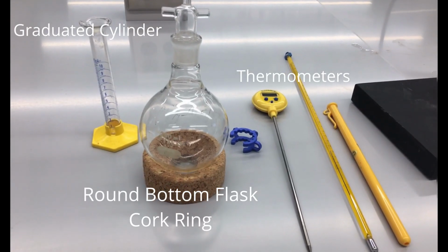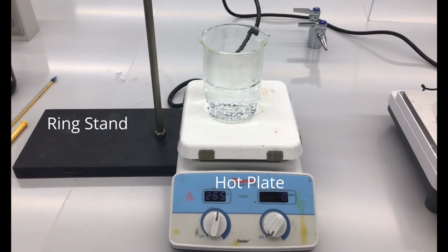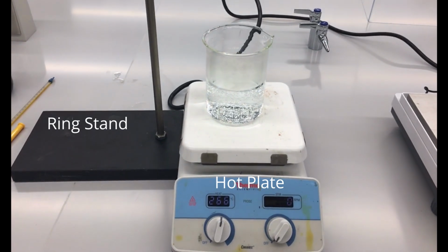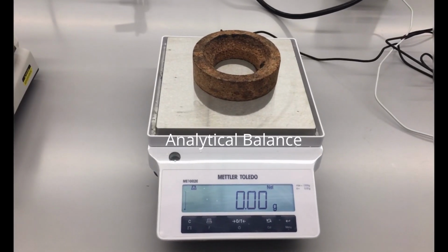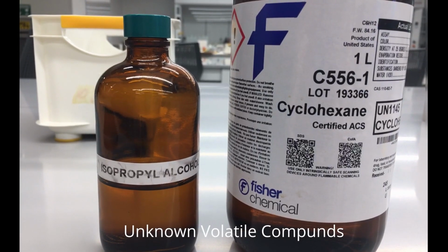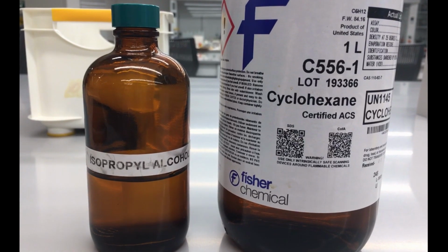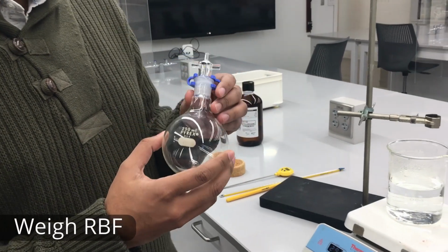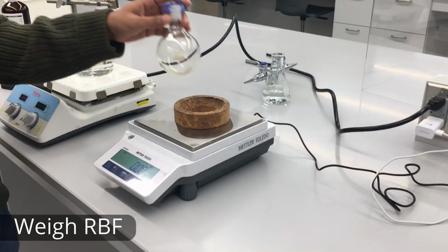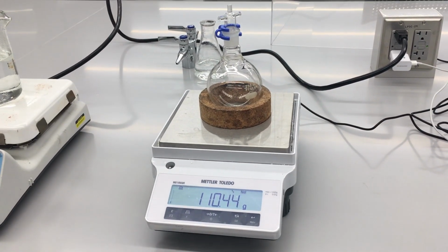Now in this lab we'll be using these materials here to figure out the number of moles and then the molar mass of an unknown volatile compound. We will first start off by measuring the masses of these things, and by subtracting that from the masses of the containers plus the compound, we can figure out the mass of the compound. So step one is to weigh our round bottom flask.